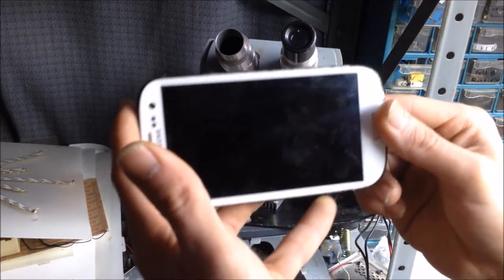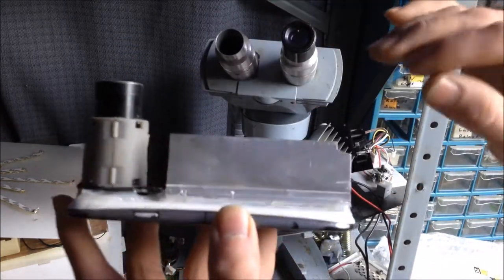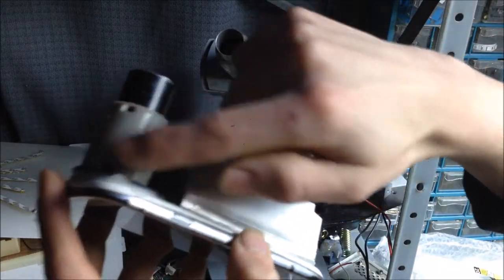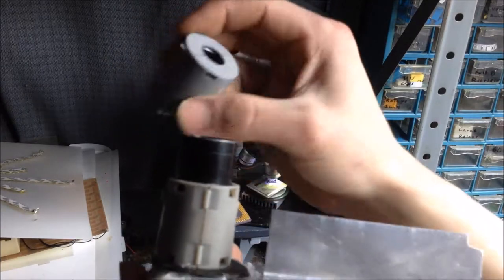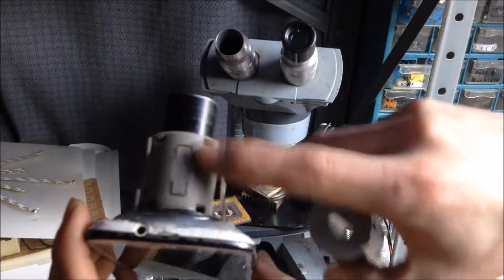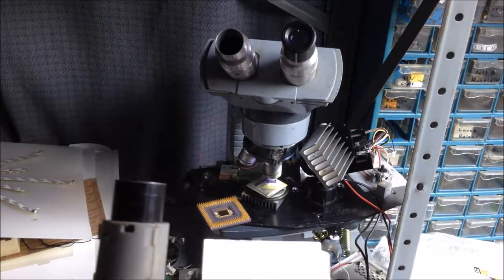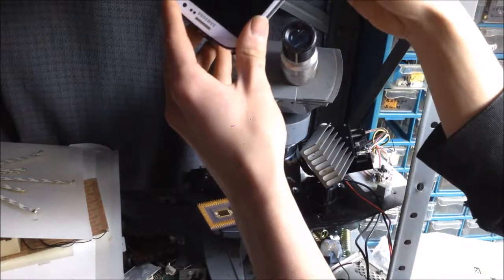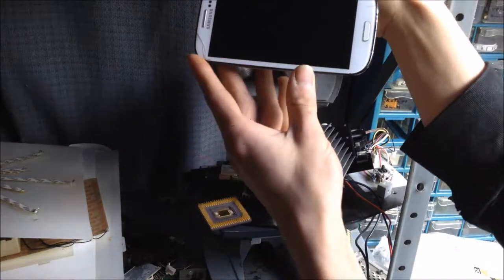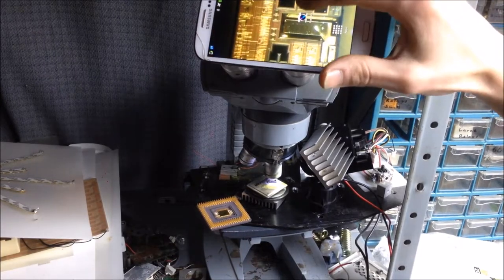I've taken a Samsung Galaxy S3 and on the back I've glued on this plate which rests on the right eyepiece. And I have this plastic bracket, and this bracket came from one of these clip-on ferrite cores. I did have to trim down the diameter of the eyepiece on the lathe a little bit, but that's okay because it worked super well. So, I get to simply put that right on my microscope now, press the button, and stand at this like I'm ordering from a vending machine.